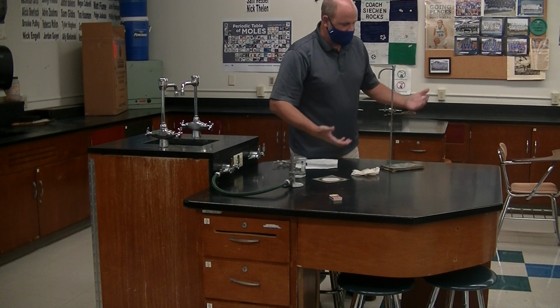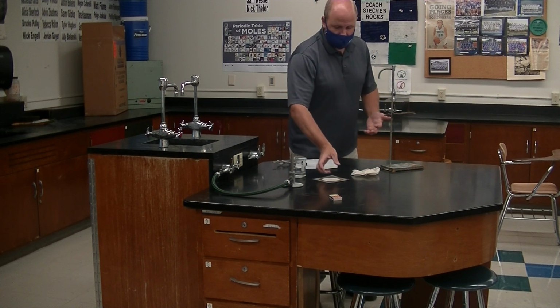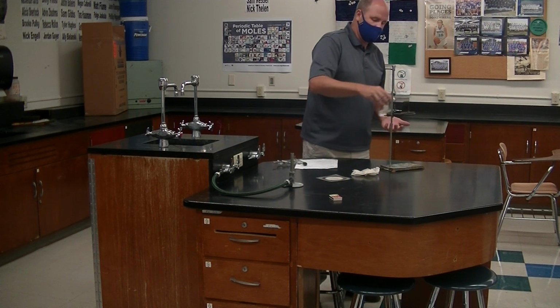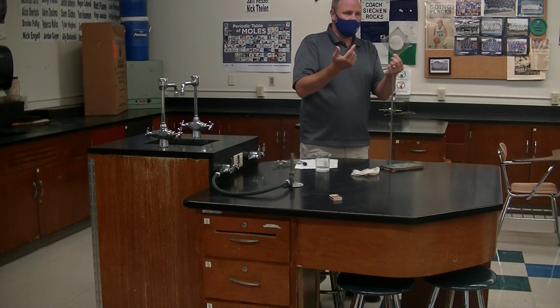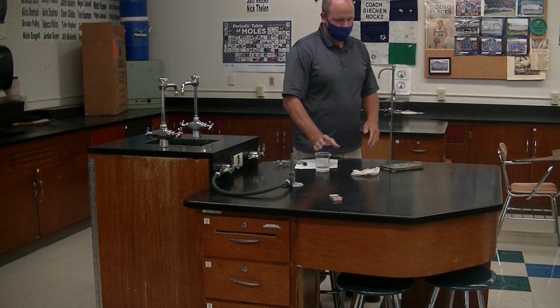Now, depending on what things we use this to set stuff on, depending on the size of it, you might be able to set it right on there. It's not really the safest thing to do, but you can. We will use these pieces of wire mesh. It's called wire gauze, and we'll set it on there. Now it's a pretty stable spot to set some things on.